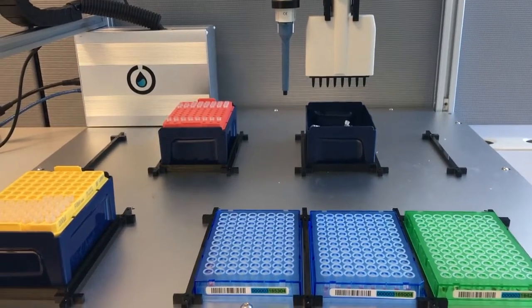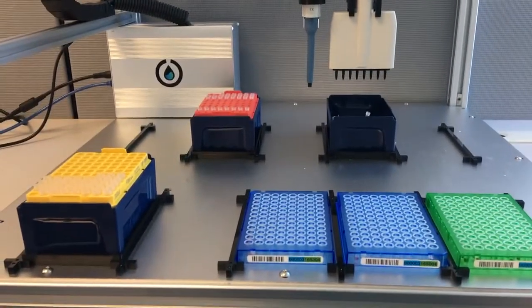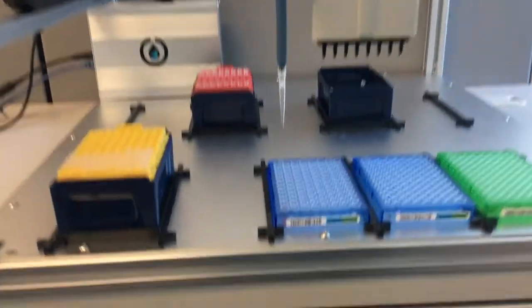And that just repeats for the next row. So again, 4K, pretty simple. It's lightweight — you can pick it up with one person and easily move it around. Runs off of a simple USB cable and some pretty simple Python scripting tools. This is the last one.